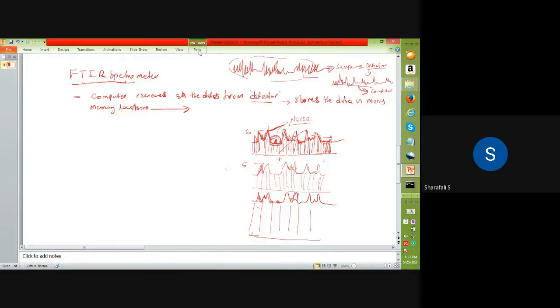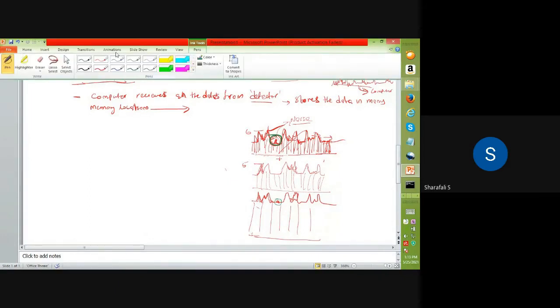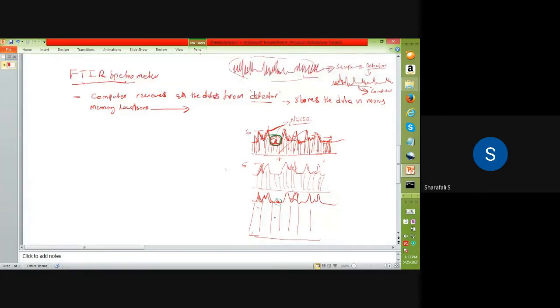That it is there in the first spectrum. So if you are considering that, we will be having more here because the intensity of the total spectra is increased. Okay, I will not draw that in that position because that is noise. So that noise will be somewhere here, because its intensity is at some 5. So we cannot take that.